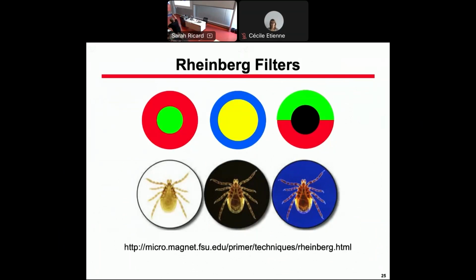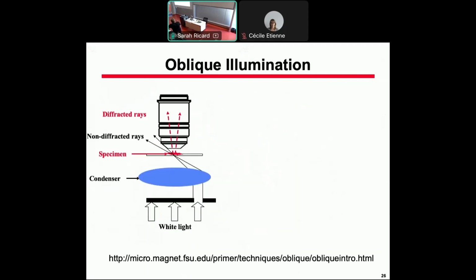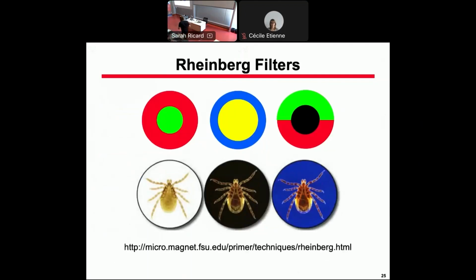And now, these are examples of filters. Yeah. You can design whatever you want. No, I'm just saying, in the middle one, you are saying that the diagonal star, the middle one. This is dark field, in fact. This is the same sample observed here in wide field microscopy, classical microscopy. Here it is with the dark field microscope. Okay, so those filters are not corresponding. No. These are just examples of filters, and these are examples of images, but they are not related. Okay. Exactly, I got it. Yeah. Thank you.